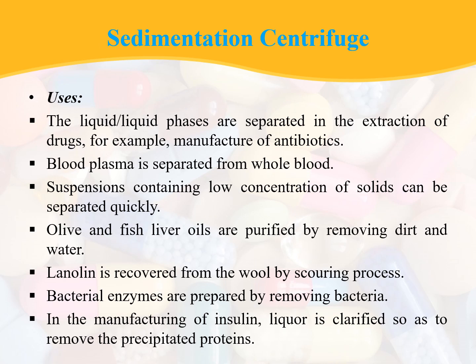Now coming to the uses of sedimentation centrifuge. Liquid-liquid phases are separated in the extraction of drugs, for example, in the manufacturing of antibiotics. Blood plasma is separated from whole blood, and suspensions containing low concentrations of solids can be separated quickly. Olive and fish liver oils are purified by removing dirt and water.